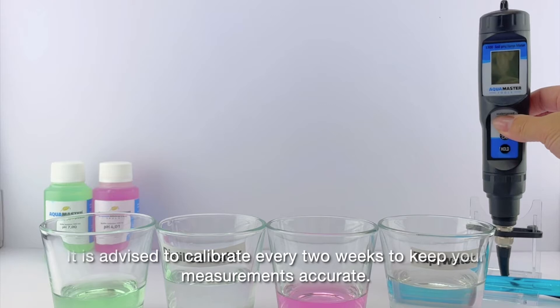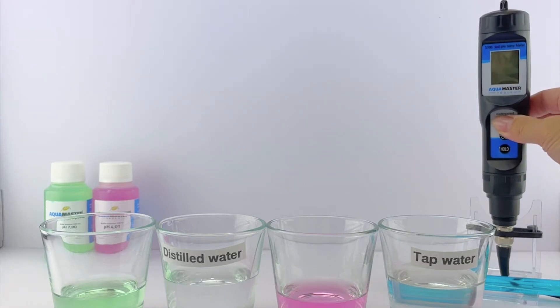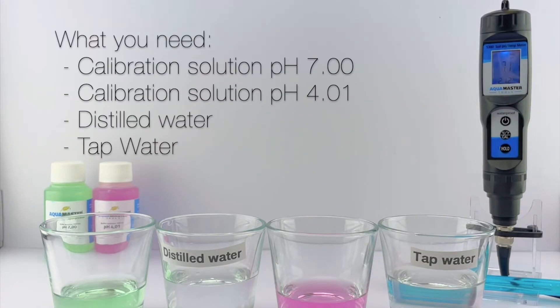It is advised to calibrate every two weeks to keep your measurements accurate. What you will need: calibration solution pH 7, calibration solution pH 4.01, distilled water, and tap water.